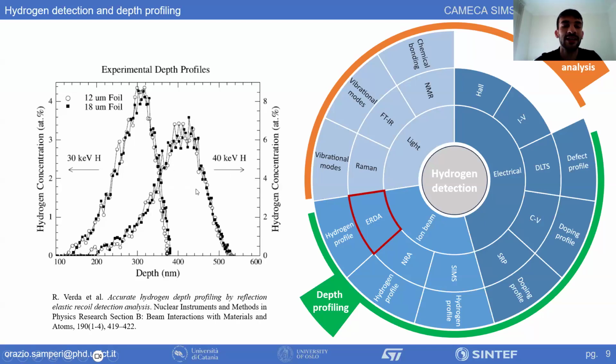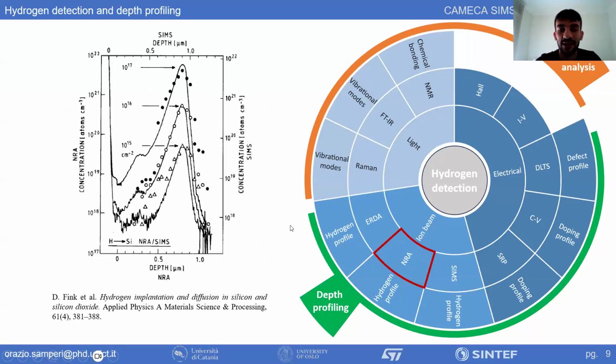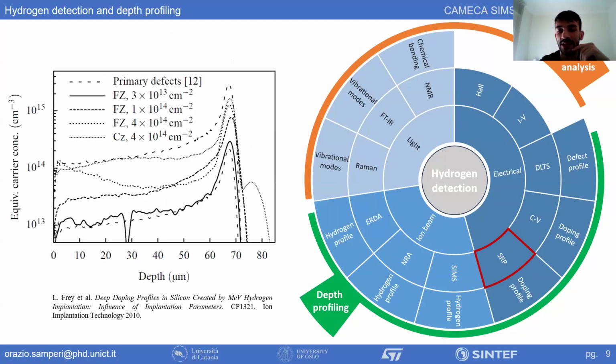Similar story for the nuclear reaction analysis. It's another technique, quite similar to ERDA in terms of limitation, let me say. And these are basically the two options with ion beam techniques, other than SIMS, but we will discuss it later. I'll just say something about the electrical techniques.